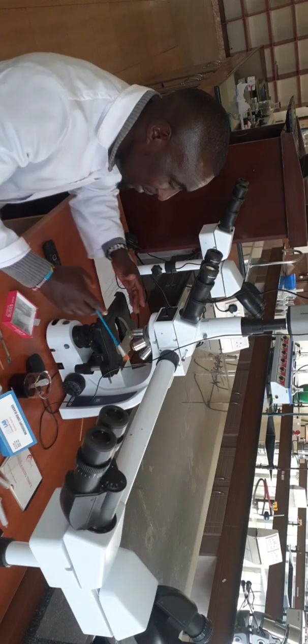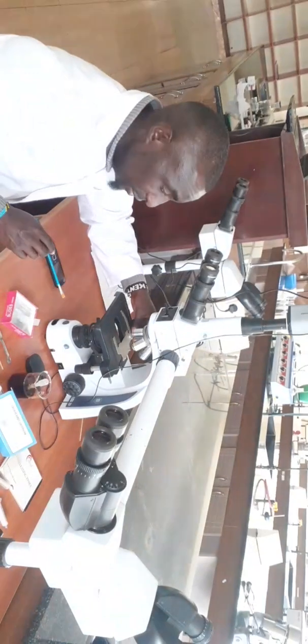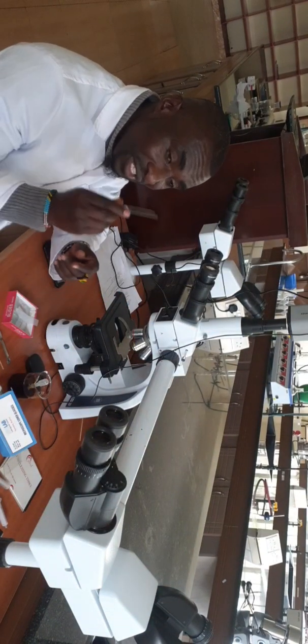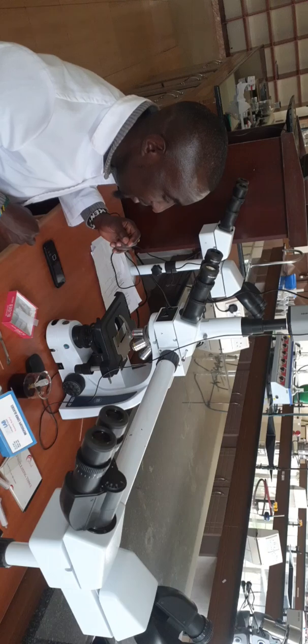We have got the stage. This is the stage. This part is the stage. Stage clip. This one ensures that once the specimen on the slide has been placed here on the stage, it clips the slide. So this is the stage clip.